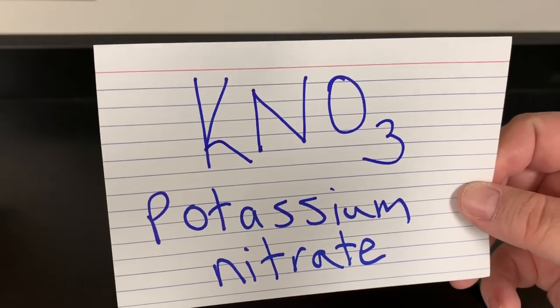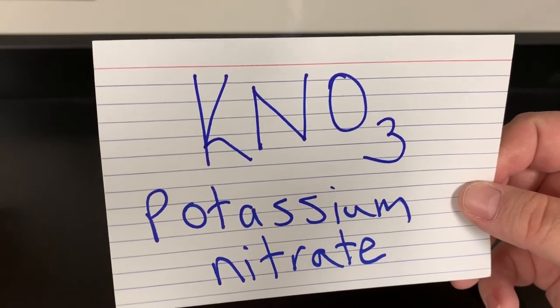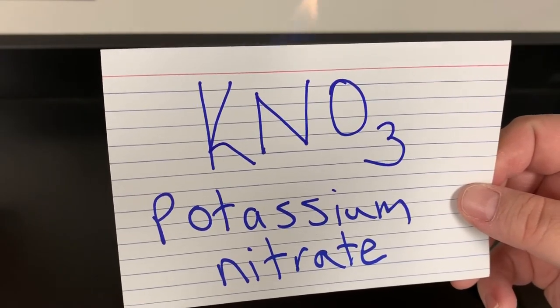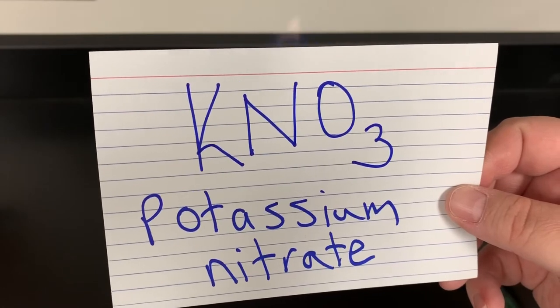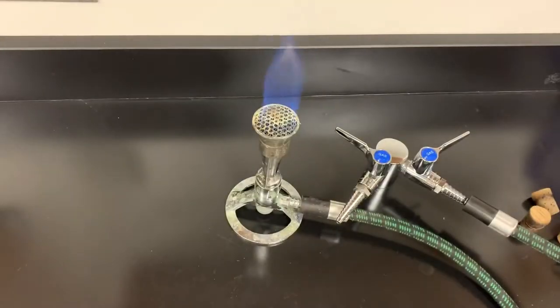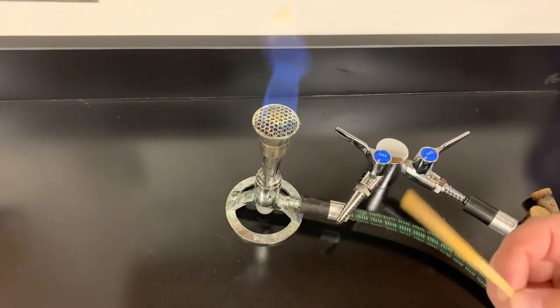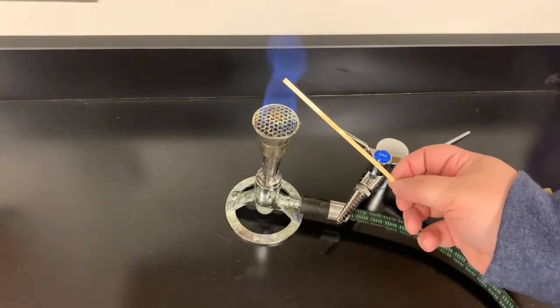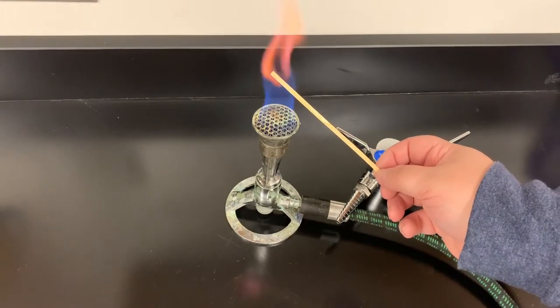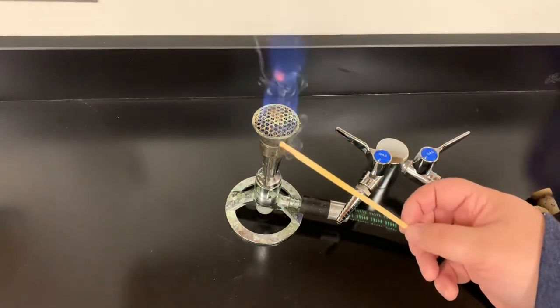is KNO₃, which is potassium nitrate. You may need to pause the video so that you can write down the chemical formula and the name. I'm going to take a stick that has been soaking in potassium nitrate and put it into the flame, and we can see it changes it into a purplish color.